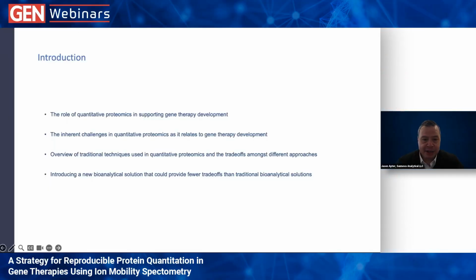Thanks, Uduak, for the kind introduction, and thanks, Mark and David, for joining us today. Just a bit of context, what we were hoping to accomplish in today's discussion is a few things. First of all, a discussion on the role of quantitative proteomics in supporting gene therapy development. Secondly, we're going to dive into the inherent challenges in quantitative proteomics as it relates to gene therapy development as well. And then we're going to take you through an overview of some traditional techniques that are used in quantitative proteomics and some of the trade-offs amongst the different approaches. And then finally, we'll introduce a new bioanalytical solution that we're excited about that could offer fewer trade-offs than traditional bioanalytical solutions.